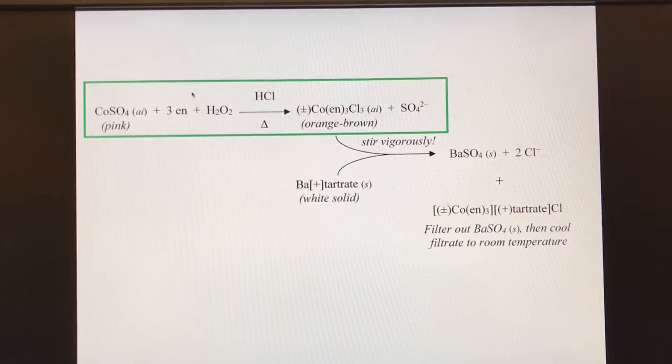So we have made those available to you. Another thing about the cobalt compound is that not only is it hazardous to you, but also to aquatic life. So that is definitely not something we want to be putting down the drain. Ethylene diamine is a pretty strong base, so you do want to be careful with that. There are other hazards associated with that.